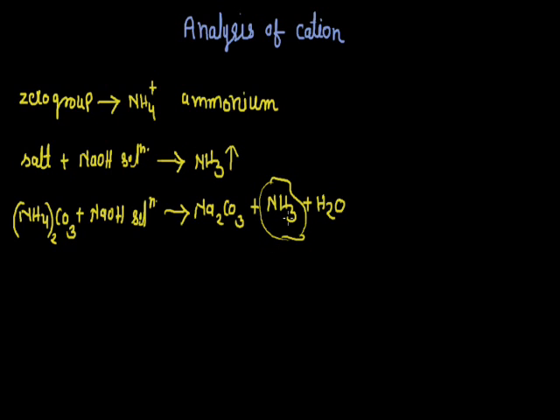So if an ammoniacal smell comes out from the test tube, we can say that this salt may contain zero group, meaning the salt contains the ammonium cation.